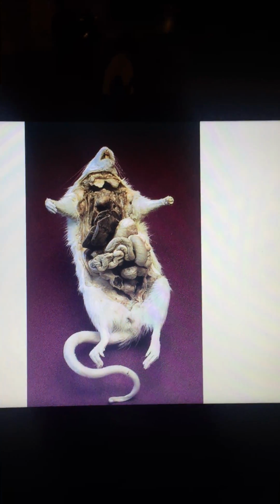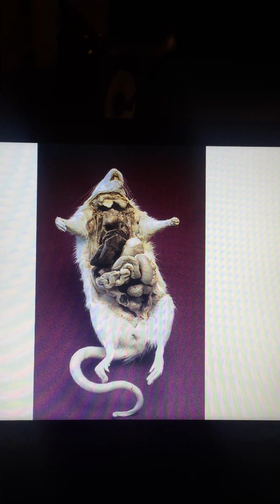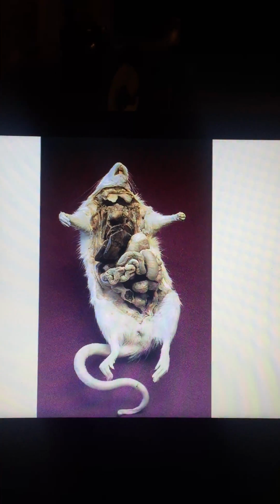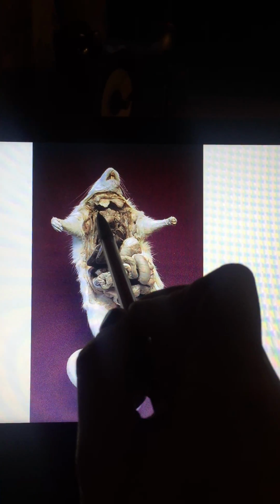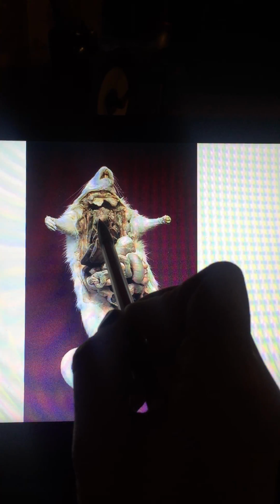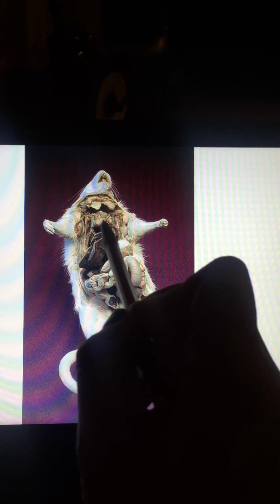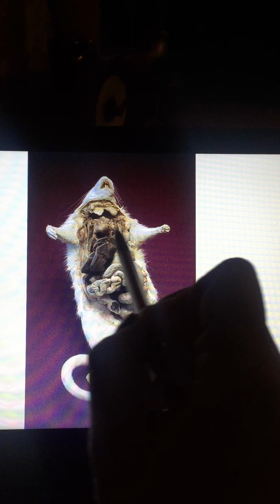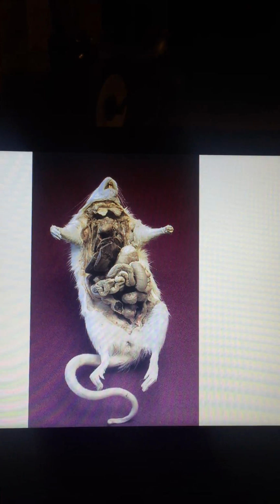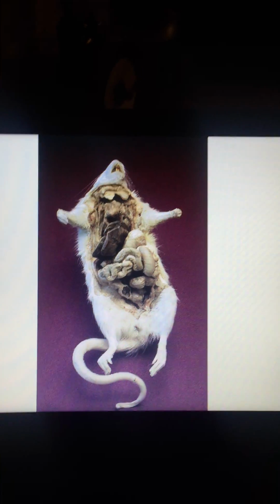Think to yourself, what's in your chest? You have your heart, your lungs, your ribs, and your diaphragm. So you have those same parts right here then, in between the arms of the rat. Use that as your guide to help you. In the very center of the chest right here, I see kind of a round but slightly pointy end nugget in the center of the chest. This nugget in the very center of the chest, again, in between the arms here, is the heart of the rat. And we should remember again that the function of the heart is to pump and circulate blood.